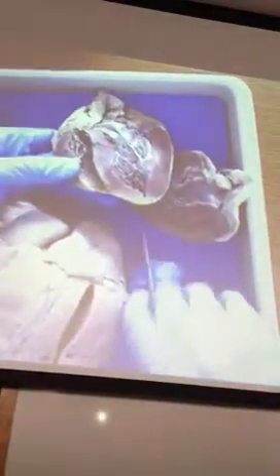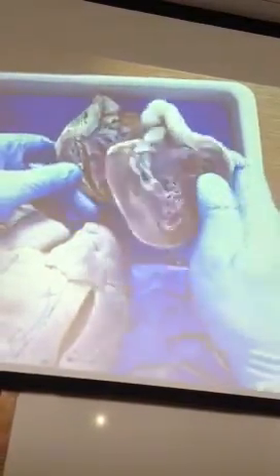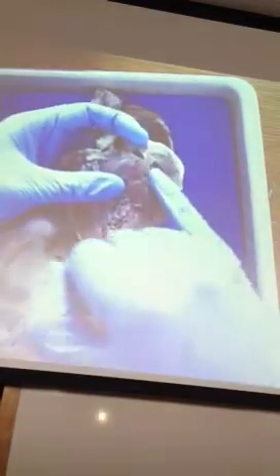Now, coming off of the right ventricle, you then go through what valve? The pulmonary valve, which takes you into the pulmonary trunk. We now have to switch to our anterior specimen and look at it. This is your right atrium coming up, and if you follow your finger, this should go through and out. I'm wearing it like a ring. Flip it over. I'm going out through the pulmonary trunk here.